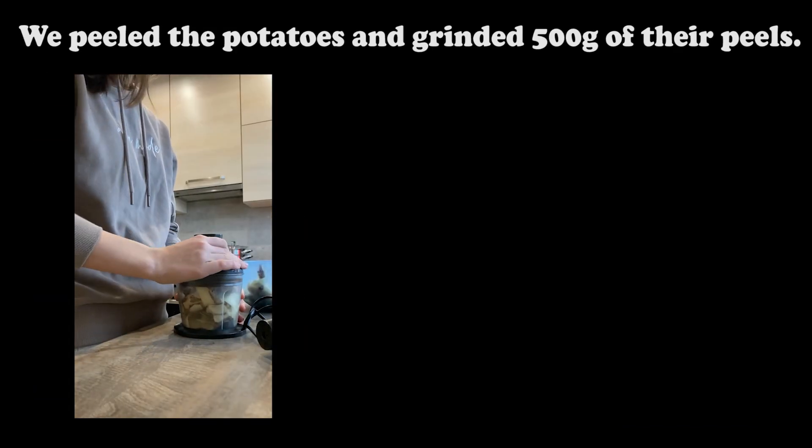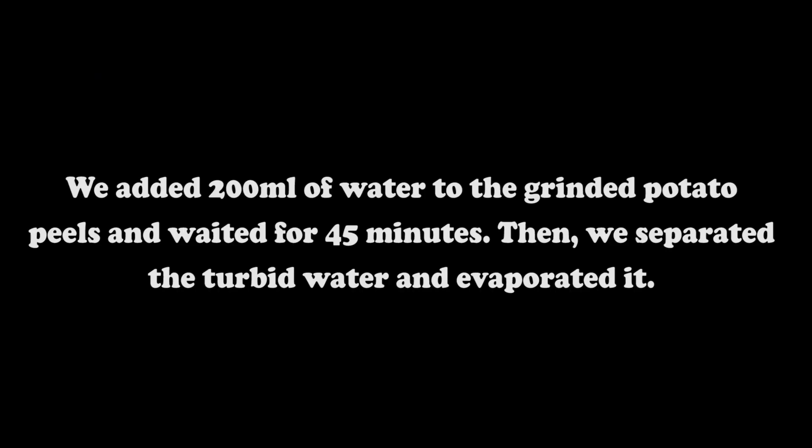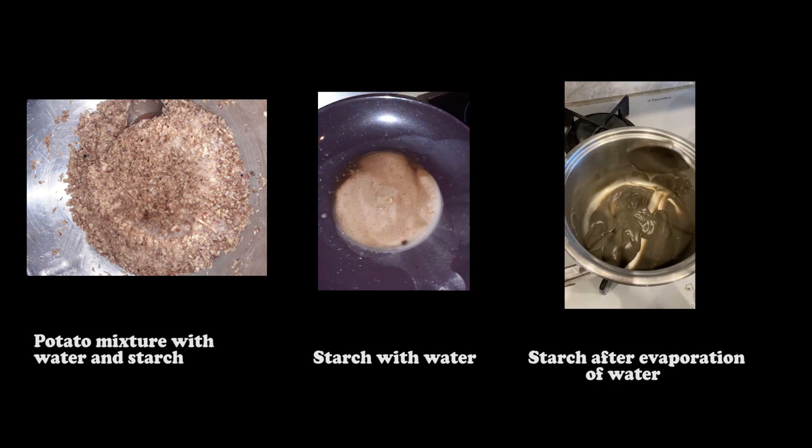The resulting mixture we ground and left to dry on paper for 30 minutes. We peeled the potatoes and ground 500 grams of their peels. We added 200 milliliters of water to the ground potato peels and waited for 45 minutes. Then we separated the turbid water and evaporated it. Here you can see photos of the potato mixture with water and starch, starch with water, and starch after evaporation of water.